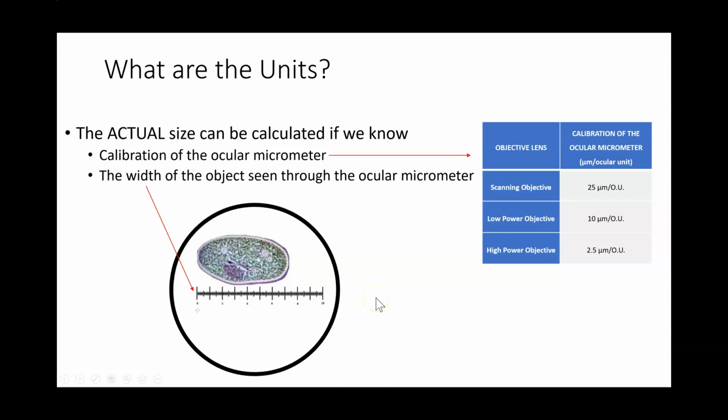Also, a note to the listener: you probably want to pause the video here and jot this chart down. It's going to be very handy for you when you do the quiz. So if you haven't done that yet, go ahead and write that down quick.